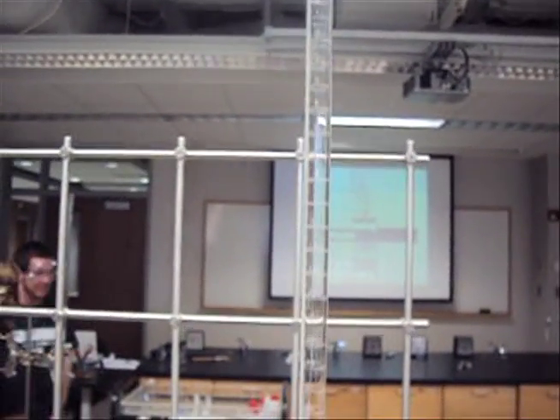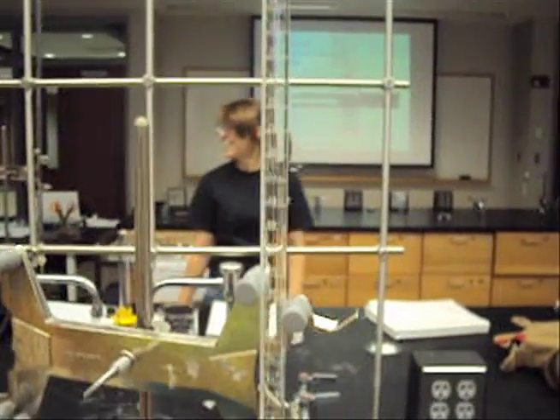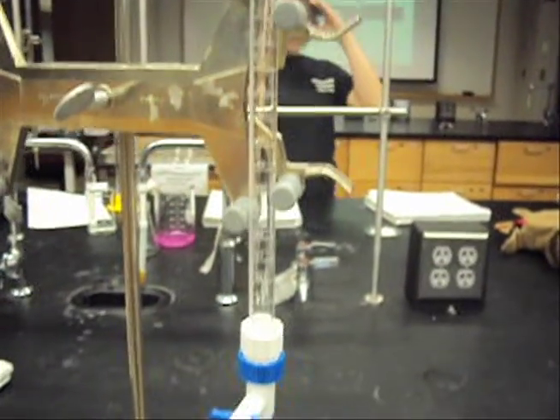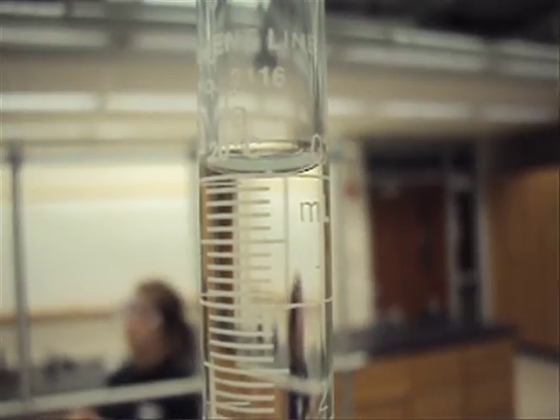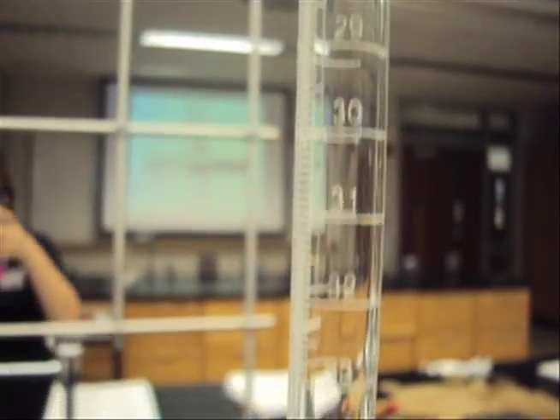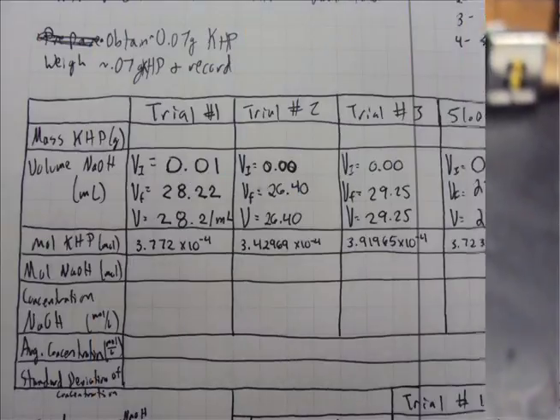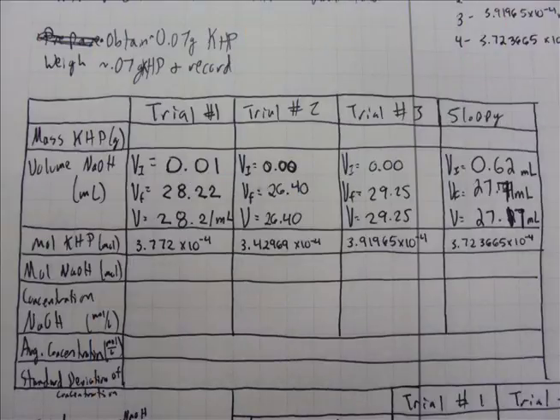To determine the unknown variable, you should collect the initial and final volumes from the burette. This is how you read volume. Look from eye level at the bottom of the meniscus. Make sure to realize the burette has 0 at the top with its increasing values going down the scale. Record digits by looking at the last graduation above the meniscus. Mark your results 1 digit past what the scale is.